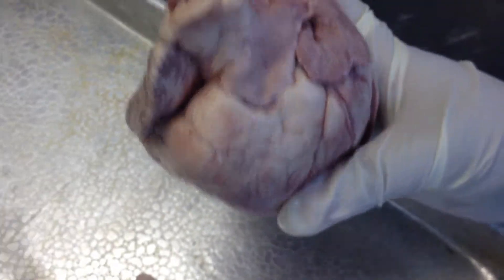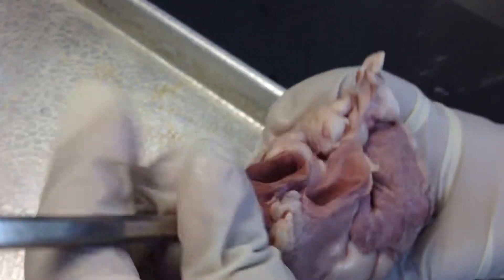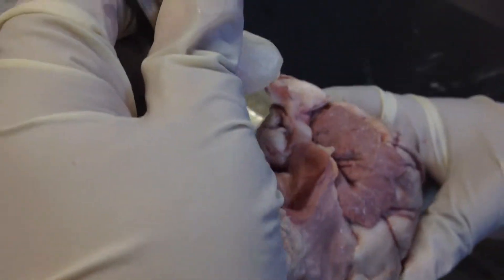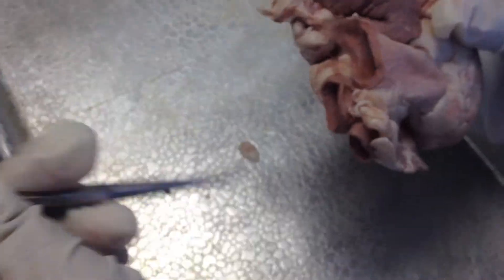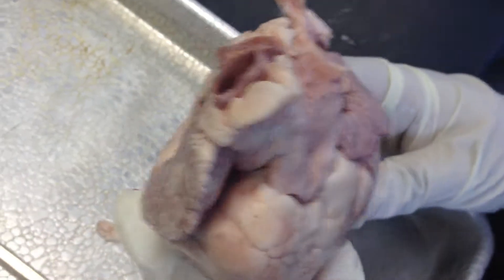We don't have to concentrate on anything above this, but just in case: this is the aorta, this is the pulmonary right here, and right here coming out on this side is the vena cava — whether it's the inferior or superior vena cava doesn't really matter.